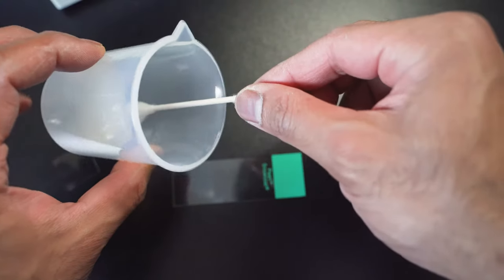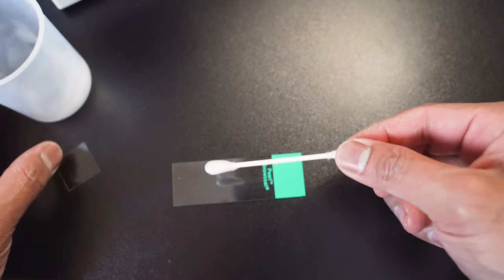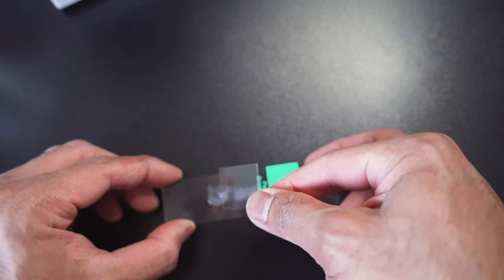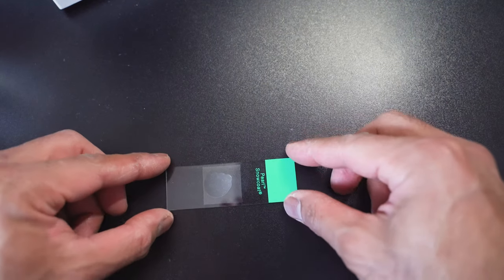Psych! All right, guys, so this is for the sake of science and for the sake of your education. I'm gonna put the sample here. Looks good, right? Then we're gonna put the cover glass and you're gonna let it drop slowly, like boom. Who's ready to see the sperm? Who's ready to see my sperm?